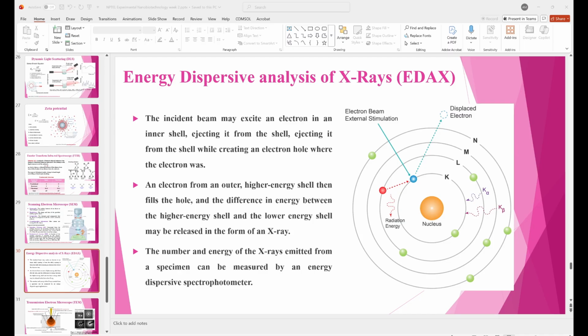Below that is the continuum X-ray, Bremsstrahlung, which is used for X-ray diffraction techniques. Exactly at the surface, above the others, is the Auger electron, which gives you surface atomic composition. Then at the end of the volume, you get cathodoluminescence, that gives you electronic states information. So all the above ones are for the surface, whatever is striking the surface and is reflected back.